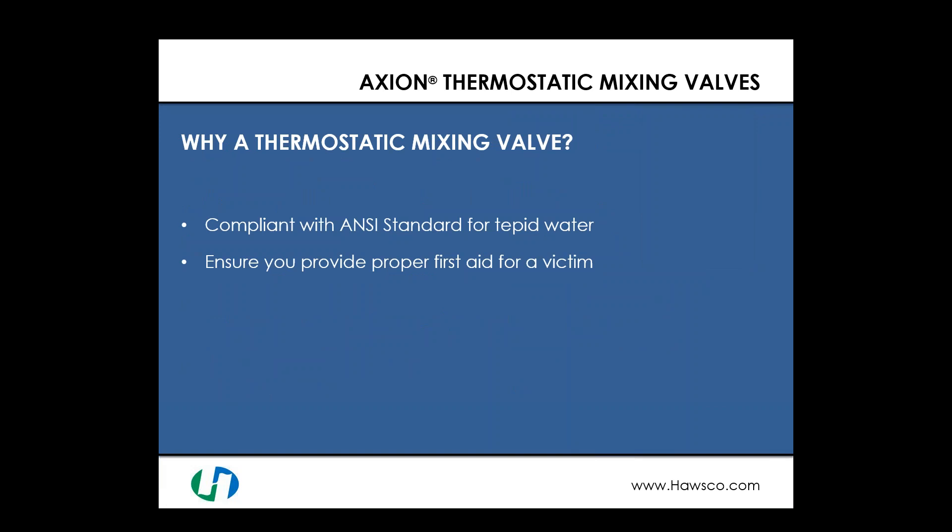With any of my webinars, I always start with the question of why — and today's question is: why a thermostatic mixing valve? It's important to know that in the ANSI standard Z358.1 2014 revision, there is a requirement that all safety shower and eyewash equipment must be provided with a tepid water supply of 60 to 100 degrees Fahrenheit. One of those ways is with a mixing valve.